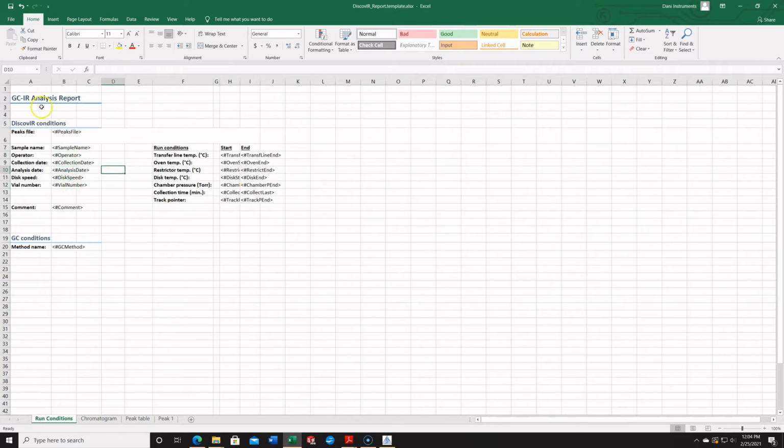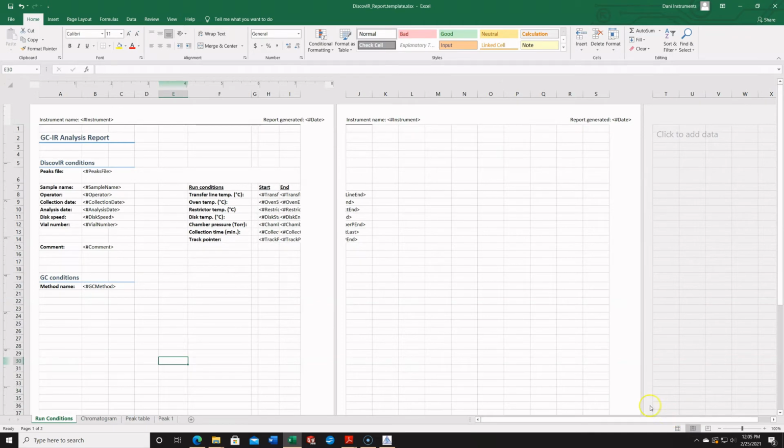Around the tags is where you can have some fun with the design of the report itself. The location, font, any additional colors, borders, pictures, etc. will show up in the final report where you see them on the spreadsheet. For a better visual understanding, click on the Layout button to see the page you are working with. Any information you would not like in the report, just delete.